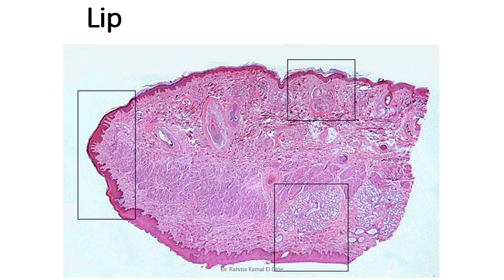The two slides that you can mistake are the lip and the eyelid. Why? One surface is skin, the other is mucous membrane. Near the mucous membrane there are glands, and between them there is a muscle. The description of the eyelid and the lip is the same. How to differentiate between them? Look at the zone between the skin and the mucous membrane.